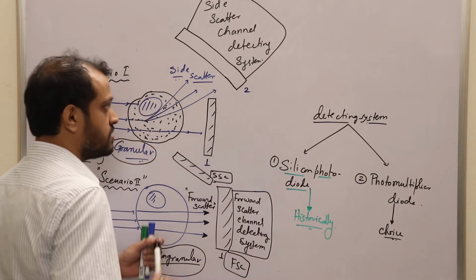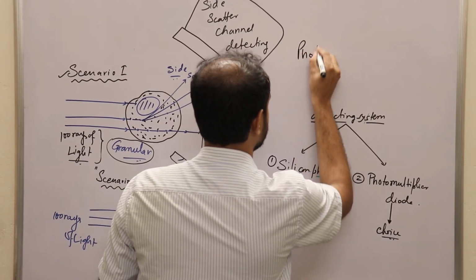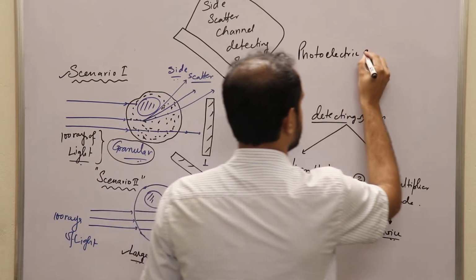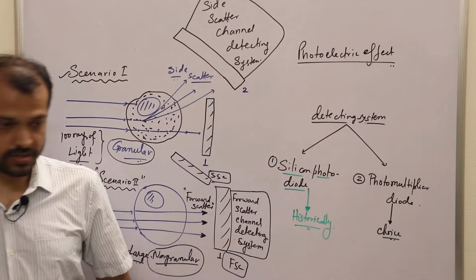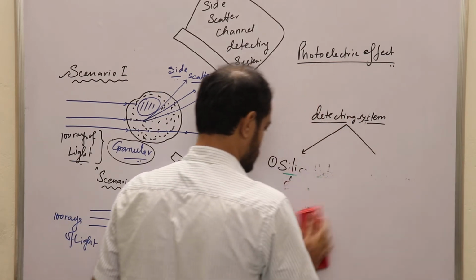Now, have you ever heard of the term photoelectric effect? Now, this was the topic for which Albert Einstein got the Nobel Prize.